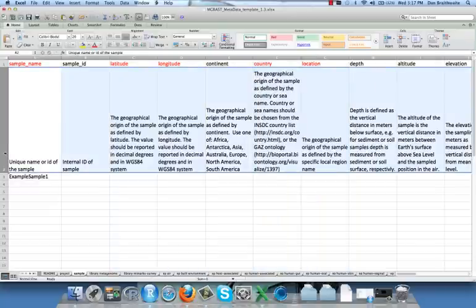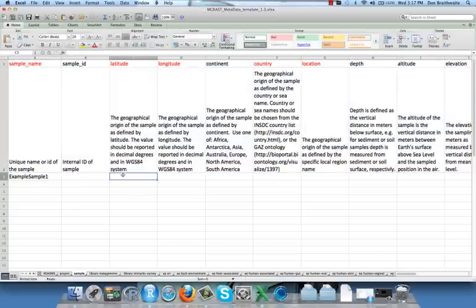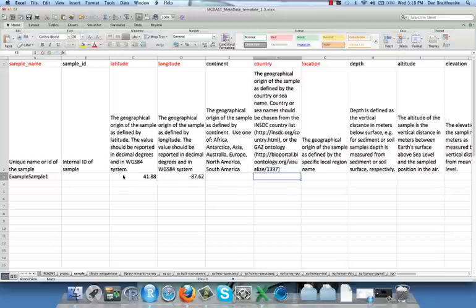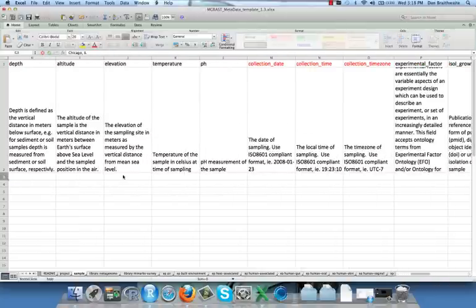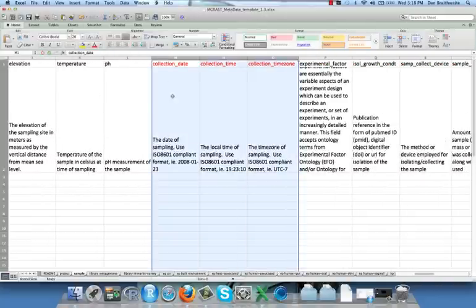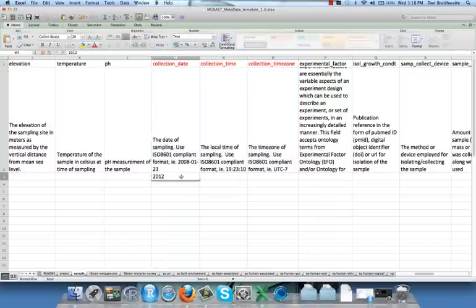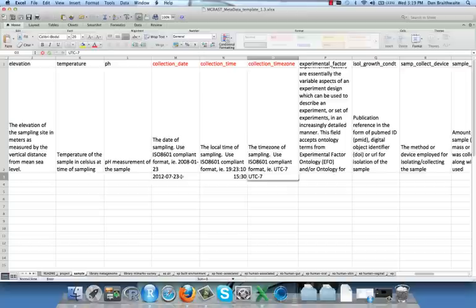In particular, use only positive and negative numbers for longitude and latitude, not directions like north, south, east, or west. For date, time, and time zone, make sure to use the indicated format. For time zone, please note that conventional abbreviations like GMT or EST will not be accepted. Instead, use the Coordinated Universal Time System, abbreviated UTC.